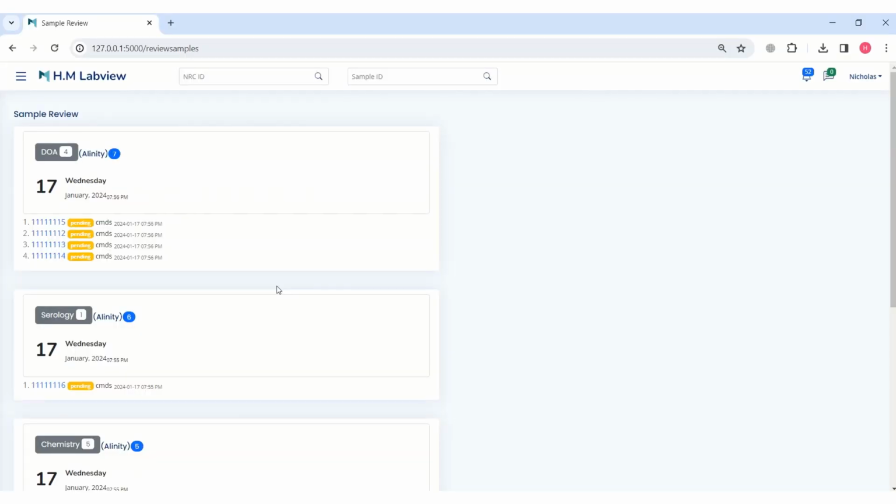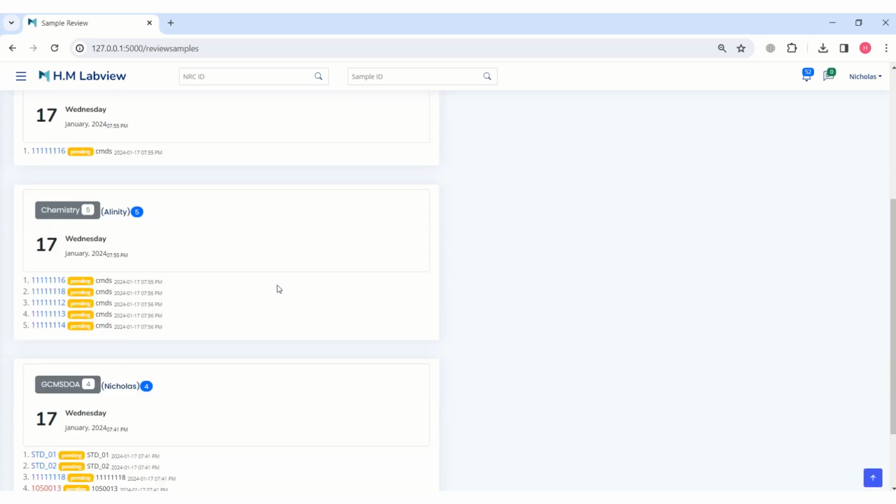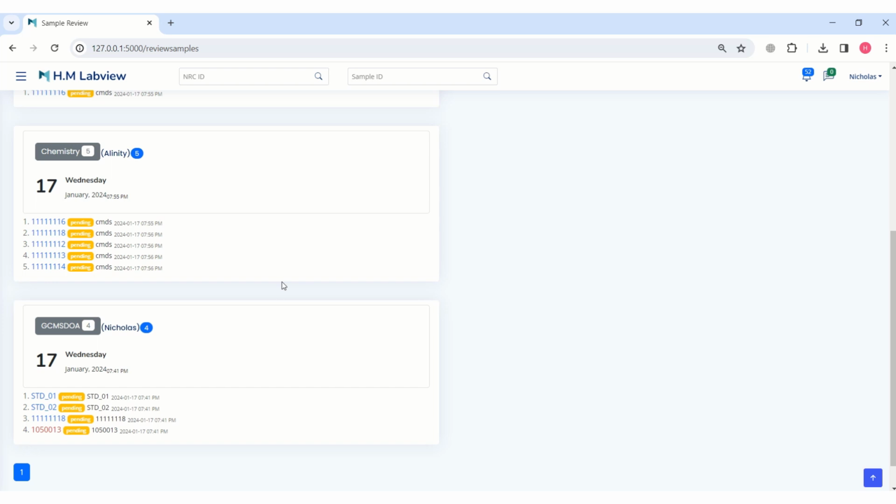Sample results need to undergo a review for approval, followed by acceptance and, ultimately, saving the accepted results into the database. Users can review uploaded sample results from either the chromatography acquisition machines or those received through HL7 messages. Upon review, they can approve the results.